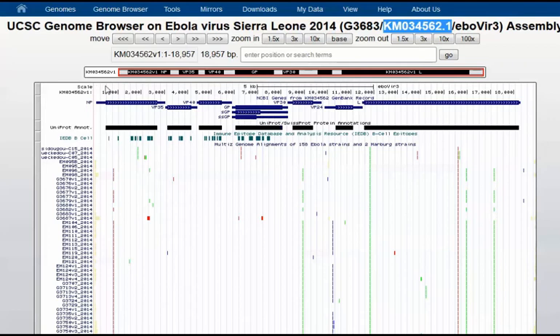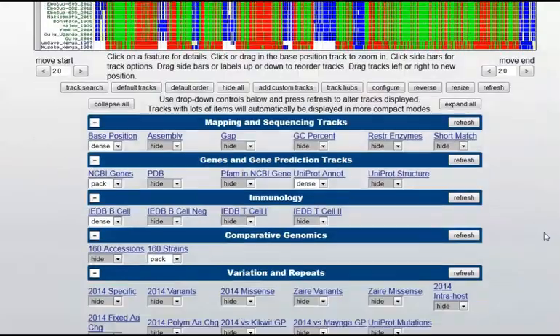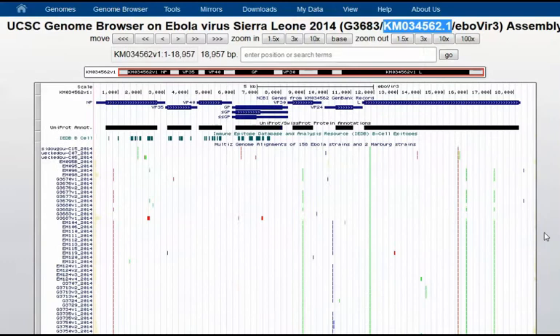The A's, T's, G's, and C's from that specific isolate would be the ones that form the framework here in the UCSC Genome Browser, and all the other details are referenced to that. So here there's a lot more detail I'll talk about in a minute. So this isolate is the one that forms the reference sequence.